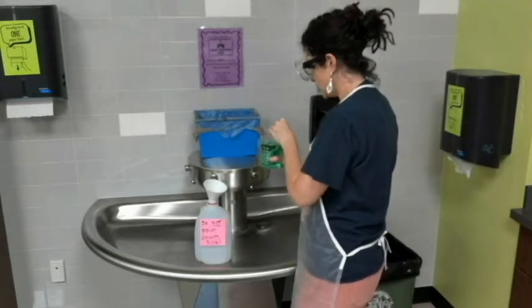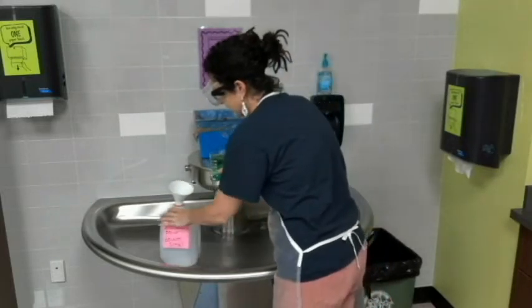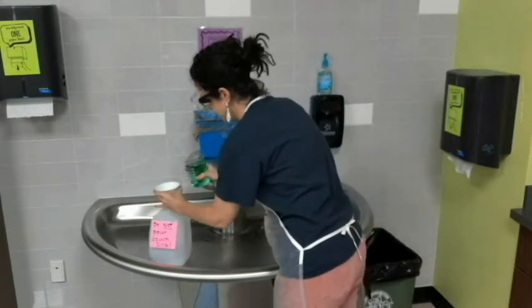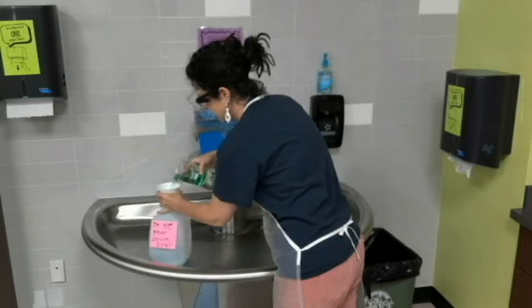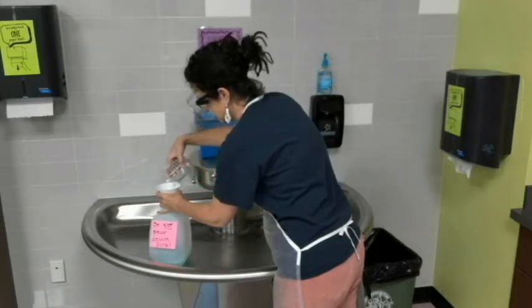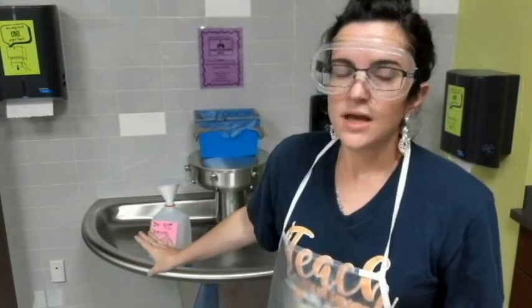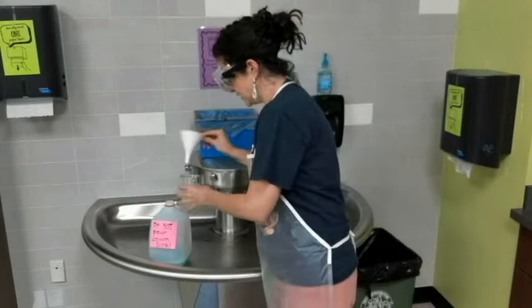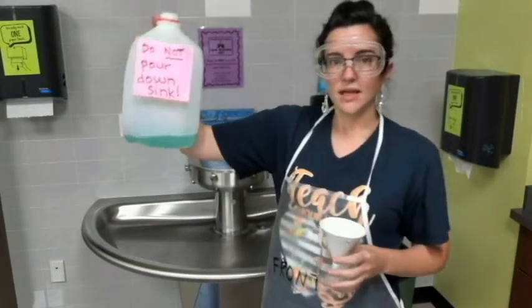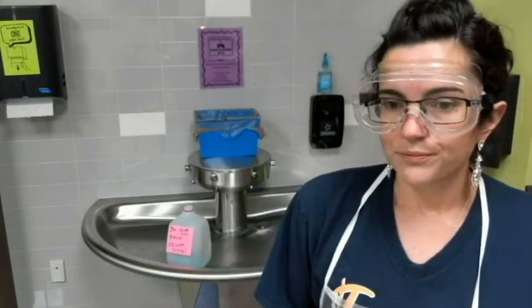So I'm going to hold my glass beaker very carefully. Okay. I'm going to hold the funnel in place, and I'm just going to pour this liquid into the jug. And then either your teacher or myself will take care of this once we figure out a safe place to dispose of these liquids that aren't deemed safe to put down the sink.